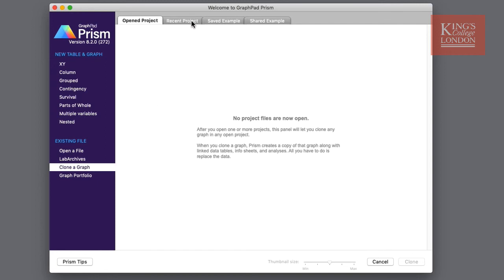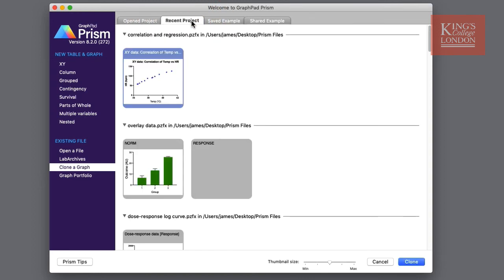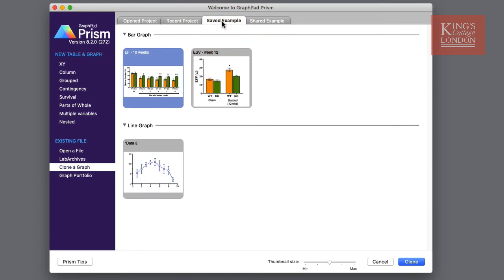The second is Recent Project. By clicking on this tab I will see all of the projects I've opened recently. You can also save yourself examples. With Prism as your go-to graph drawing and data analysis software you can save examples of most commonly used graphs and simply click on one of these to clone it into a new project.